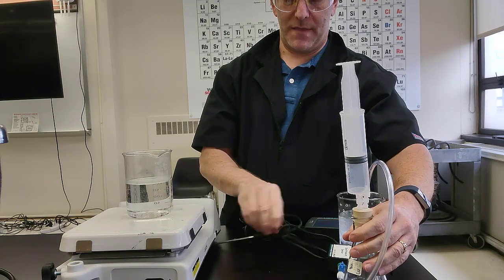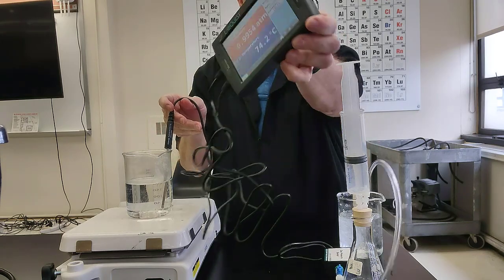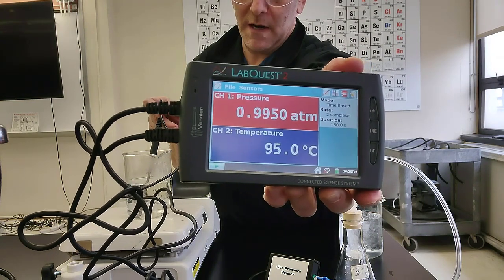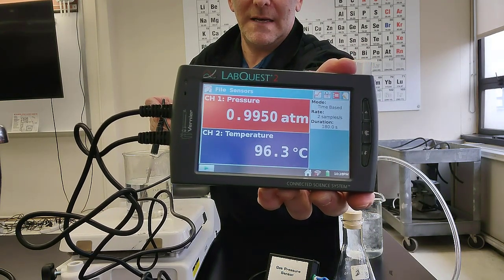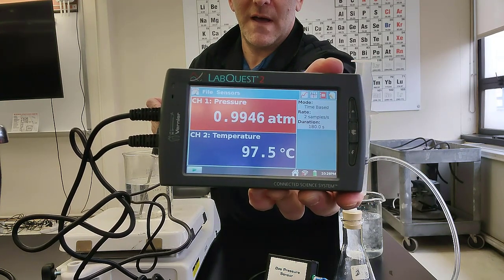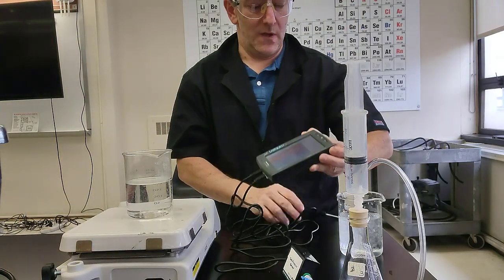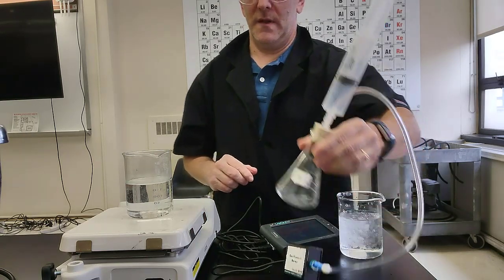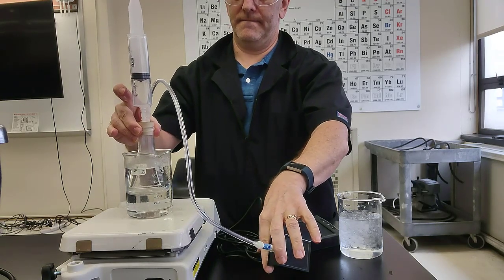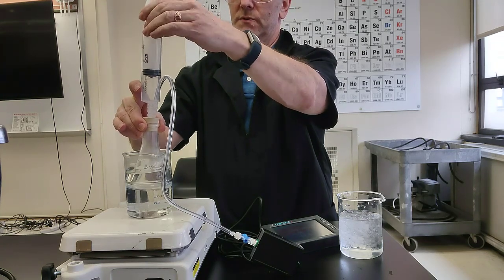So my hot water bath is boiling, as you can probably see, and the temperature of the hot water, if you want to record it, is close to 100, but we're not quite there, at around 96 degrees, 97 degrees, 97.5 degrees. All right. And then let's see, qualitatively, what happens when we put our Erlenmeyer flask down in there. Hopefully the syringe won't shoot across the room.